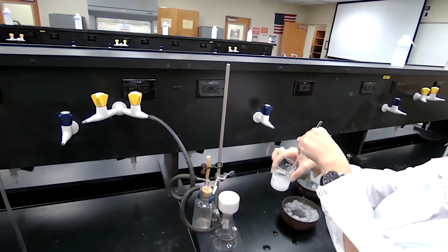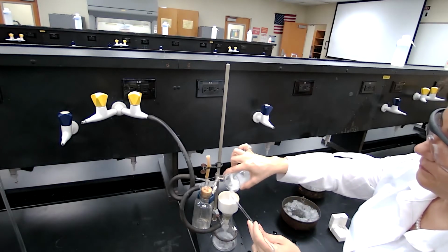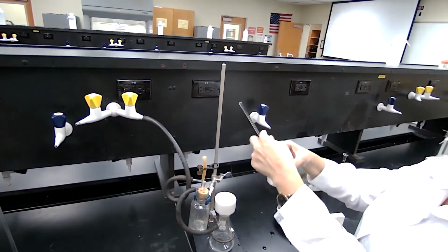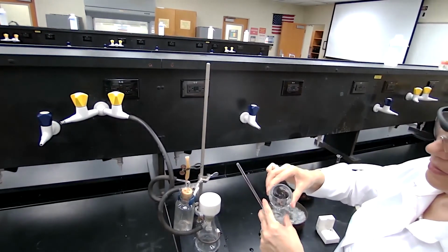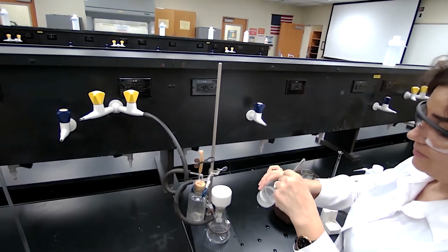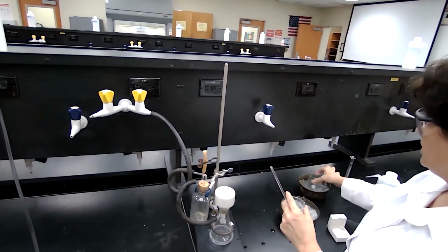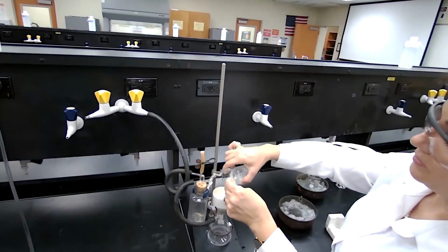I'm going to swirl this mixture because I want to get all the solids onto the filter paper under vacuum. You can hear that sound coming from applying the vacuum. Some crystals are left in the beaker. To transfer the crystals, I'm going to use cold solvent, not too much, and not room temperature solvent. Neither one of those is good because it would redissolve the sample. I would transfer everything that is left in the beaker, even if it takes two washings. Transfer all the crystals with a minimum amount of solvent into the Buchner funnel.